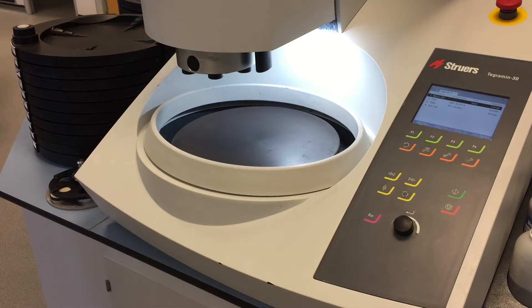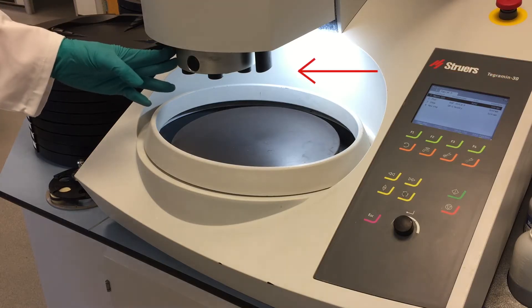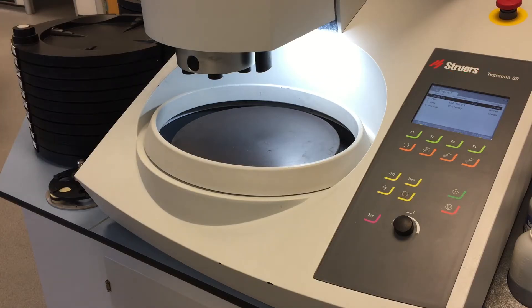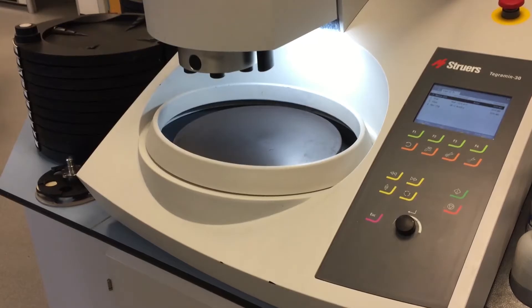The new head has dual columns which gives it a lot more rigidity, and with rigidity comes planarity. It also helps with the stock removal function, whereby you can use a specimen holder to remove up to 5mm of stock. This machine also has the standard Struers interface as you'll see on many of our other machines — our cutting machines and our mounting machines — so once you can use one of our machines the others are relatively easy too.